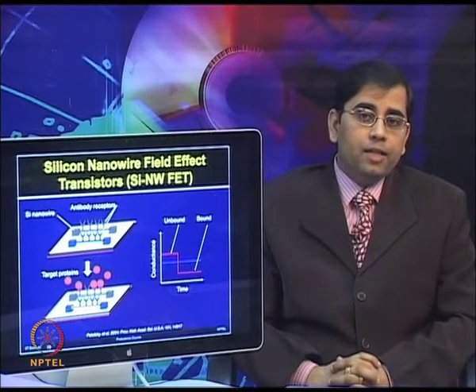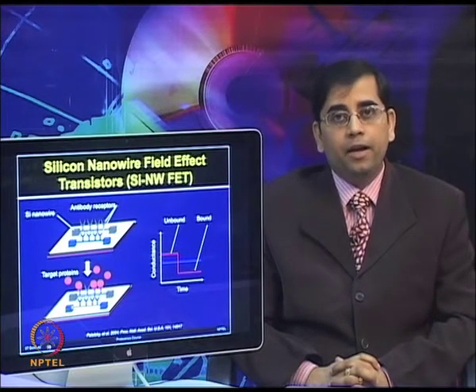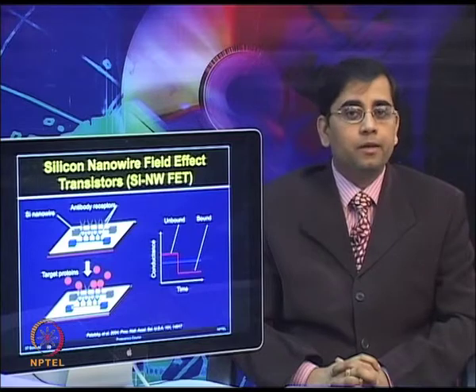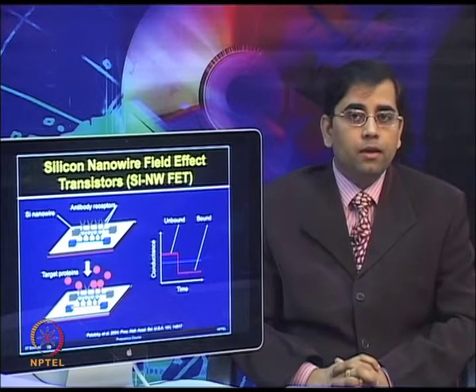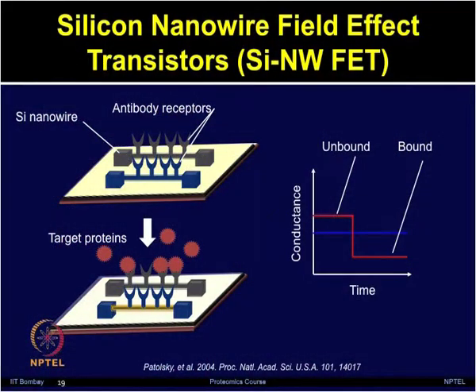Now, let us discuss how these silicon nanowire field effect transistors are applied for some of the proteomics based applications. As you can see in this slide, the top panel is showing the silicon nanowires which are coated with the antibody receptors.